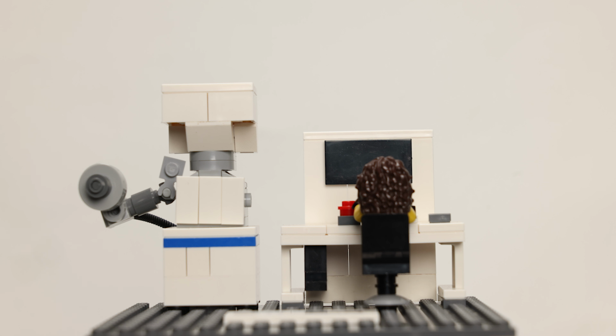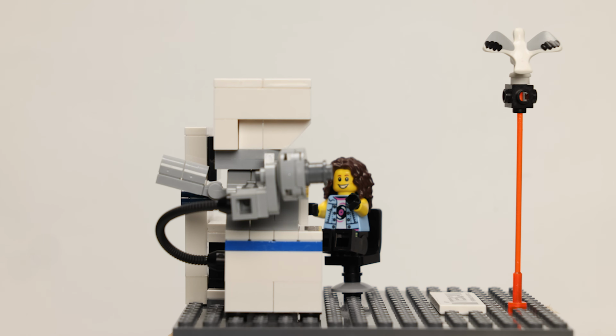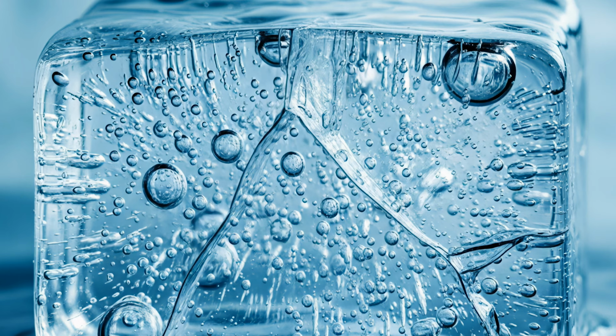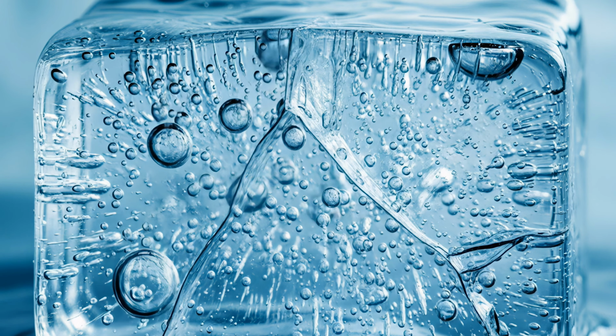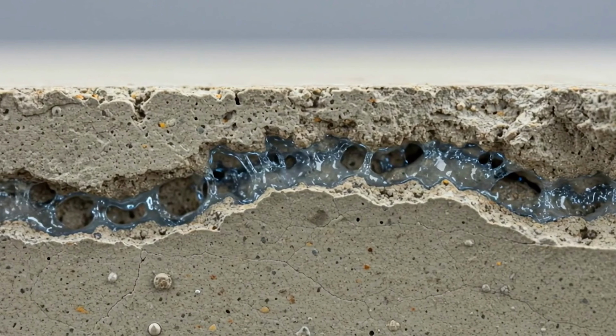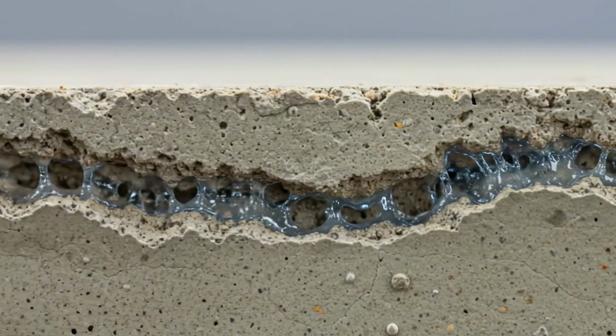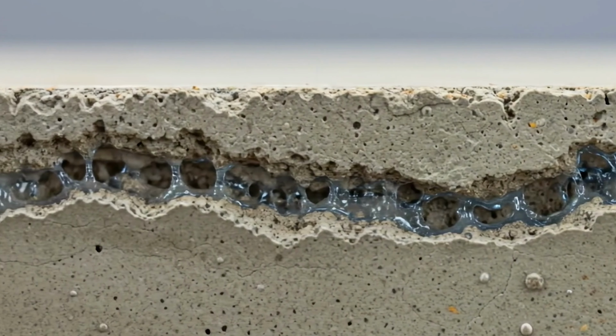To understand the significance of seeing these structures so closely, let's look at a few examples. The loading strength and resiliency of a material is closely tied to the microstructures that make up the material. The microstructure of concrete plays a critical role in resistance to freeze-thaw cycles. We purposely place extra air bubbles in concrete to improve the ability of water to freeze into larger pores and reduce internal stress buildup. Another example is wood.